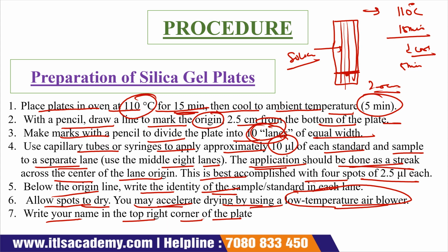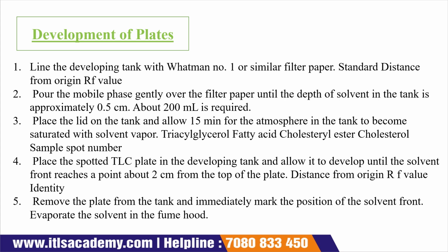Okay, if we want to accelerate the drying, we use the air blower, but the temperature of the air blower should be low. Now write your name in the top right corner of the plate. Now the next one is the developing of the plate.